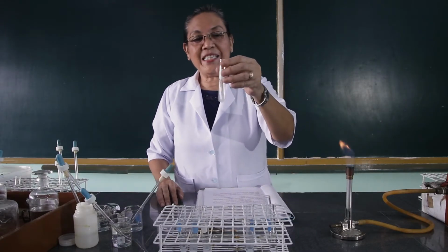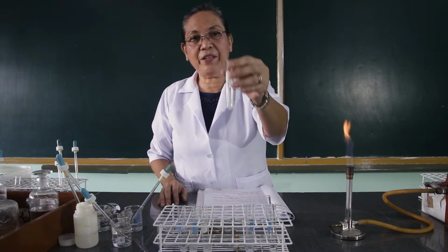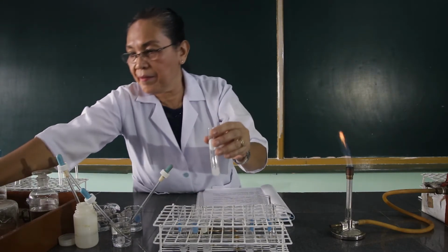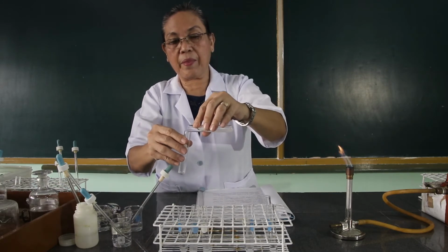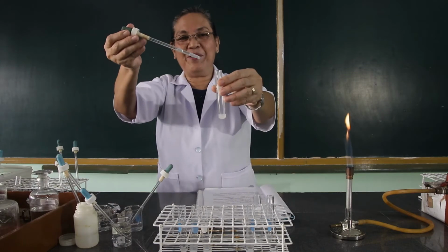This time, let's get a little amount of this mixture and then we will add it with diammonium orthophosphate. Observe what happens.